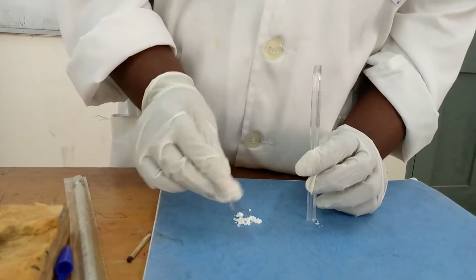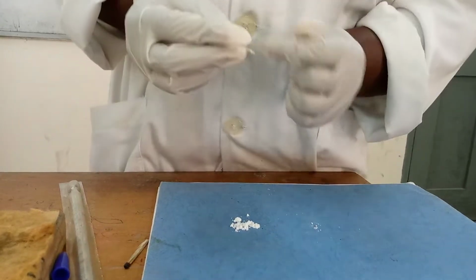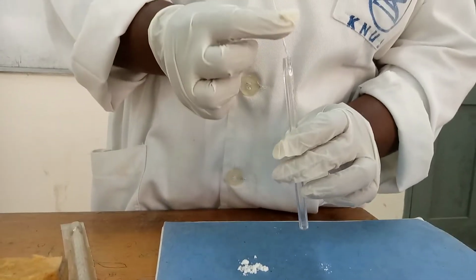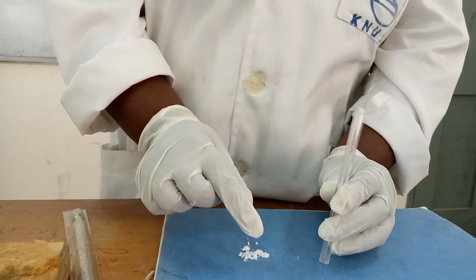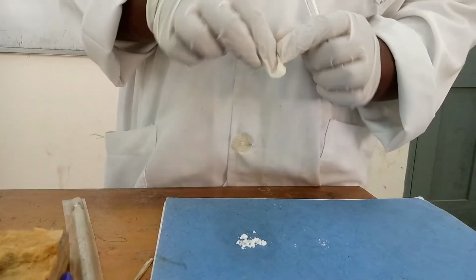Now when you are filling and you do this, if you do this for a very long time, the sample will be packed here. So when it is packed here and you are trying to drop it, it will not go down. It will be very difficult. So you just have to do it little by little. So you just dip it about 3 times, then you fill.